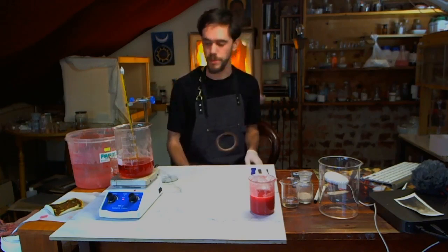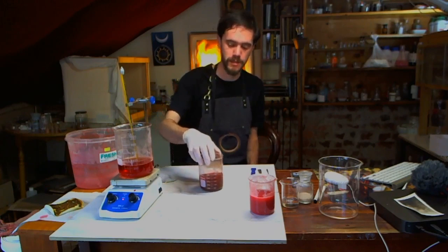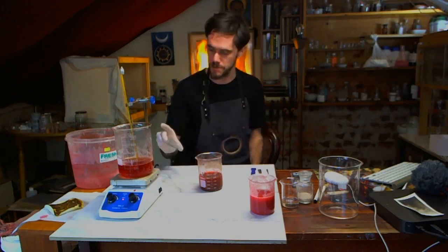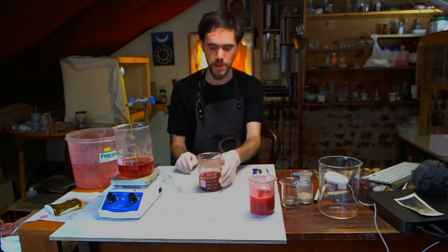Yes, I could roast the copper carbonate into copper oxide and then add nitric acid to make the copper nitrate, but I just ordered some copper nitrate recently for quite cheap. I already make enough chemicals from scratch that, you know, sometimes you just gotta buy stuff in to speed up the process.